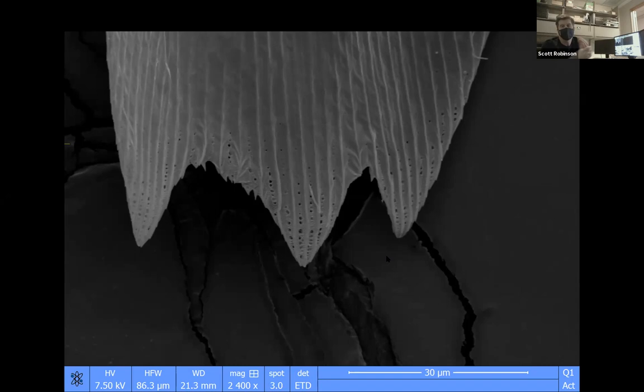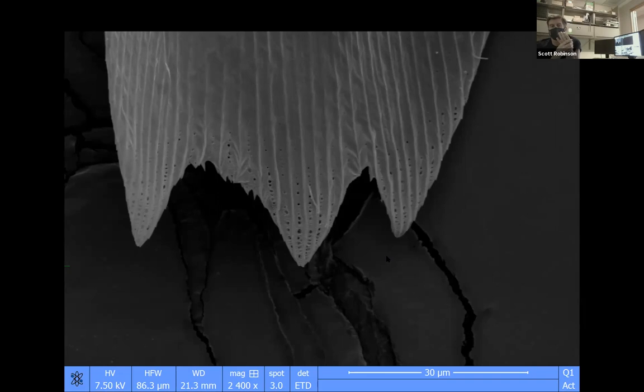And so instead of using just gold, we have a combination of, I think, 70% gold and 30% palladium, which is another precious metal. And the combination of gold and palladium gives us a much finer surface to look at. And we don't see that surface very well until we get to a really high mag on a really smooth surface.